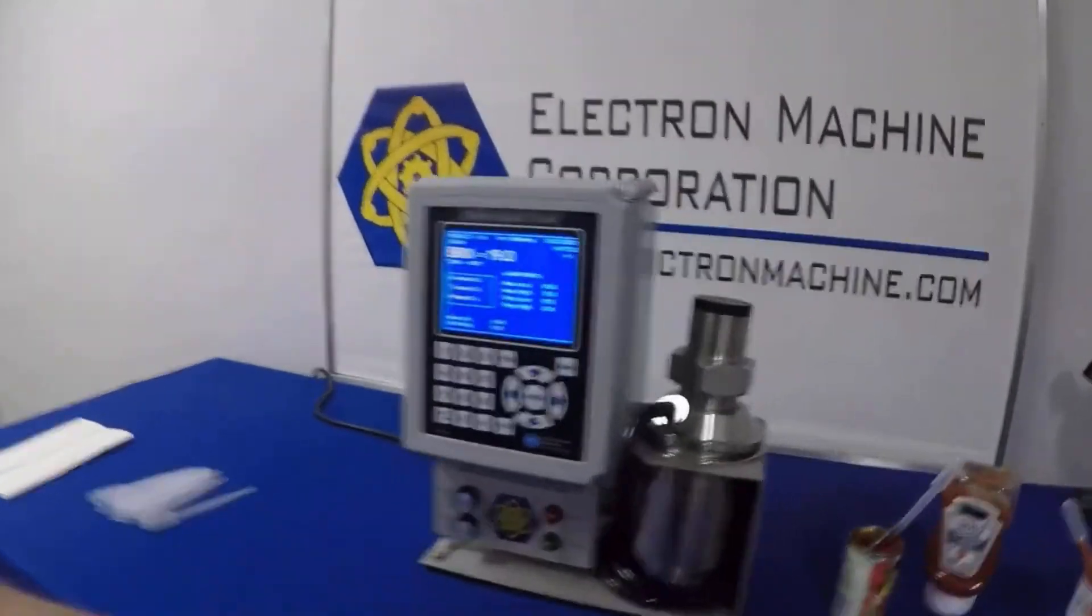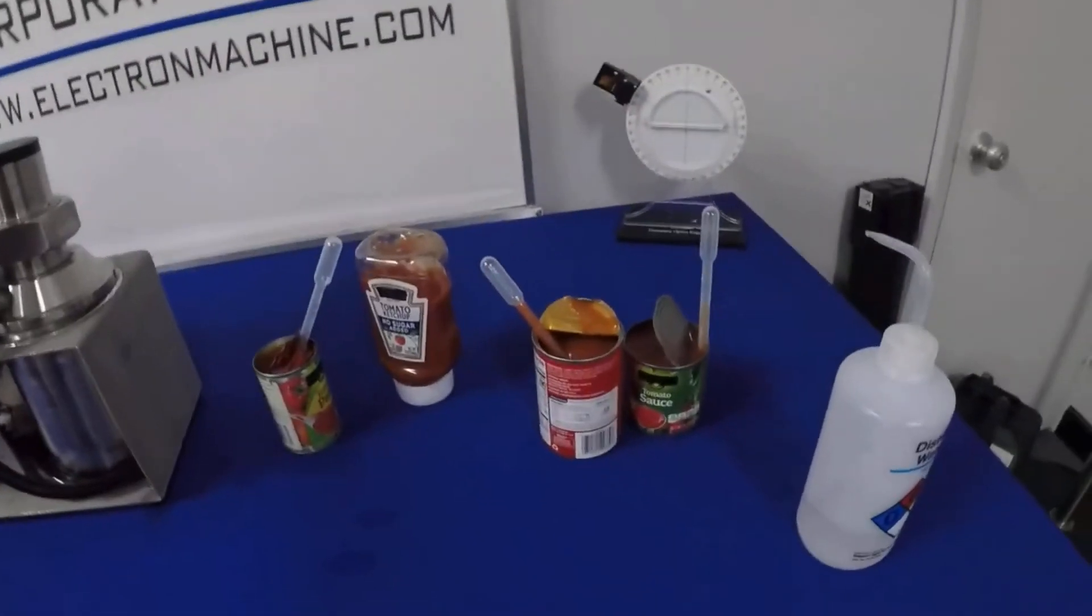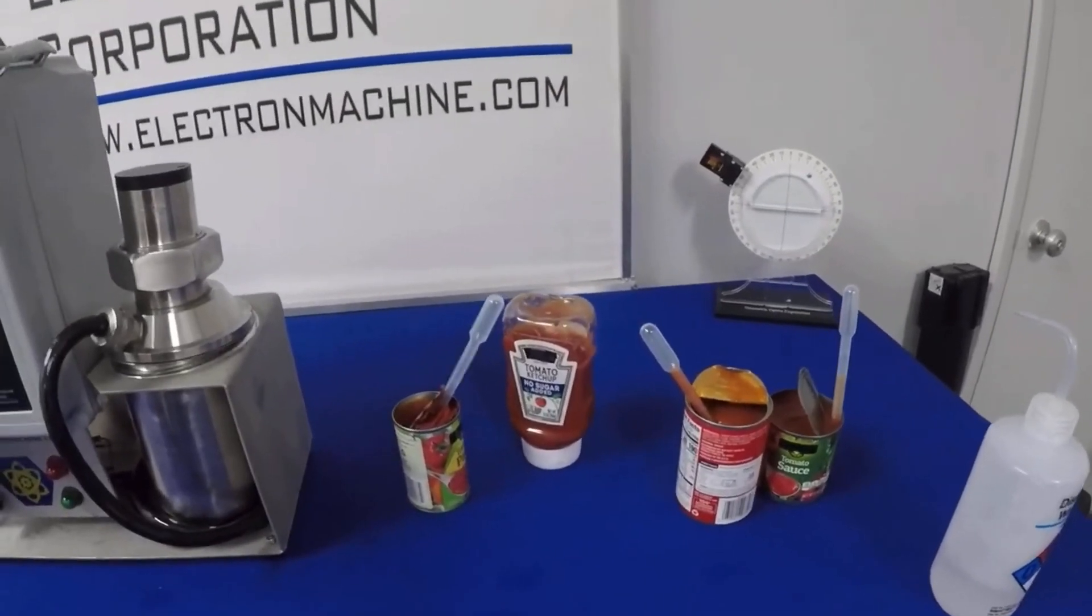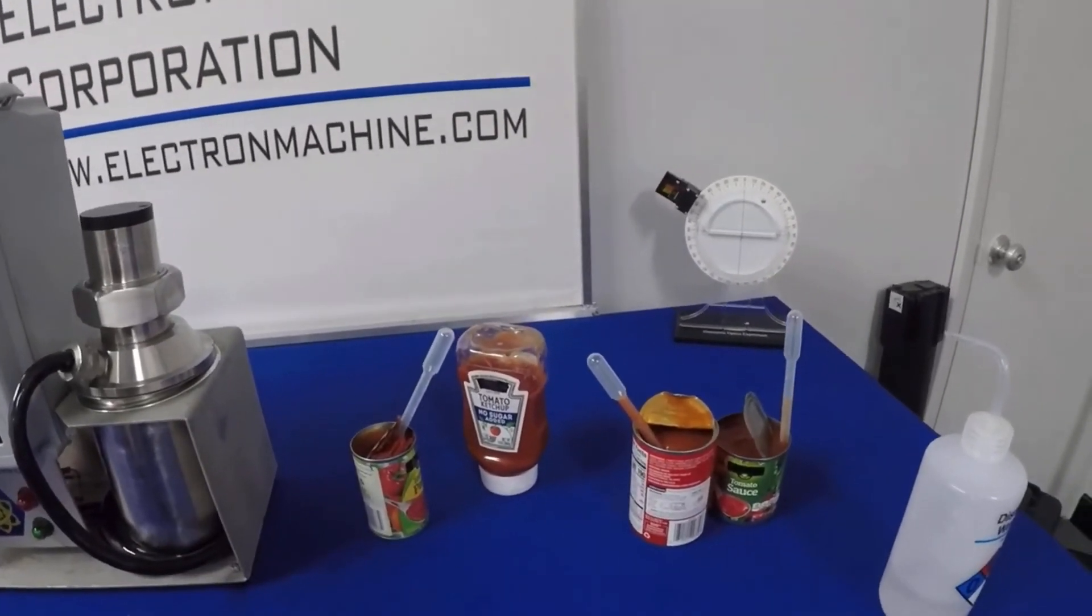So the e-scan behind me was set up on a static display. Normally it would be installed in a pipeline to measure your process as you're flowing the product through or cooking it up. And as we could tell, between the different products, we have different readings. Usually that's because some of them have sugars added, but also because it's the difference between the amount of water.